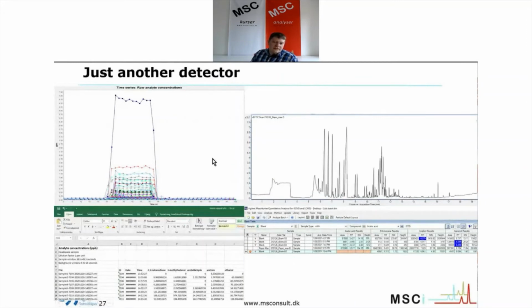Another interesting thing about this is if you look at the timescales for these pictures. The timescale on the left side is time in seconds. So you can see there's no signal, no signal. That's because I started the injection at 25 seconds.